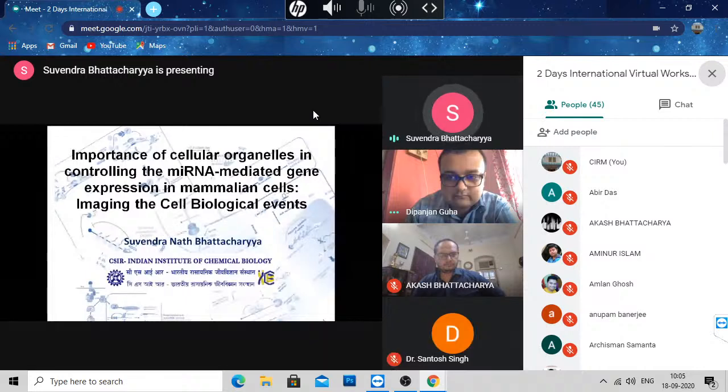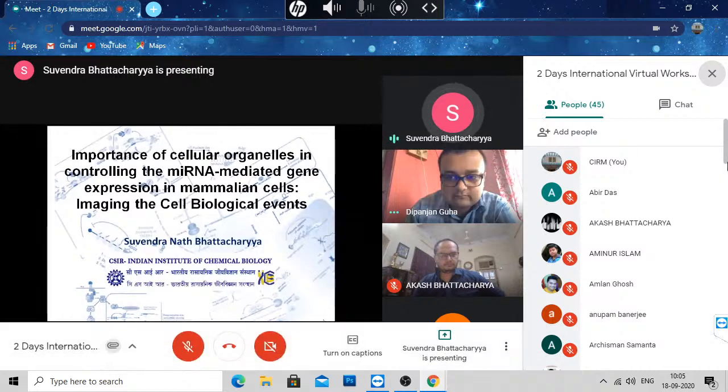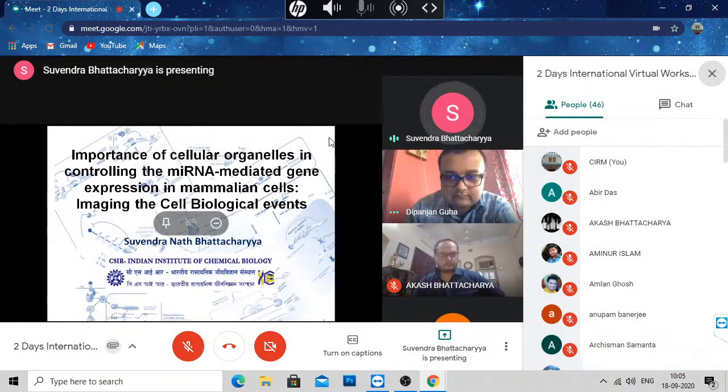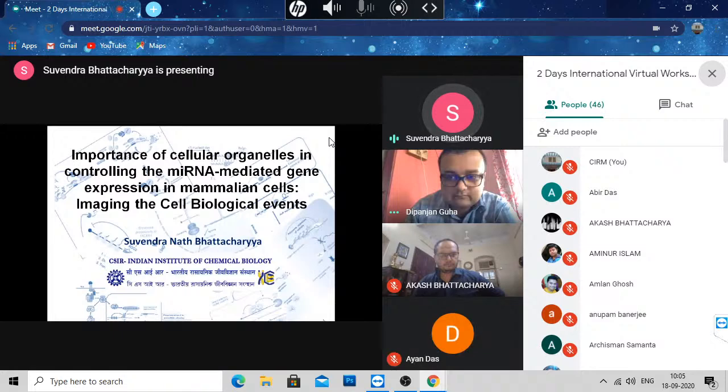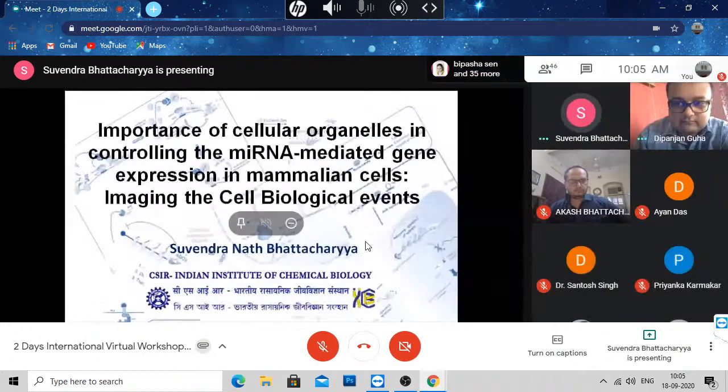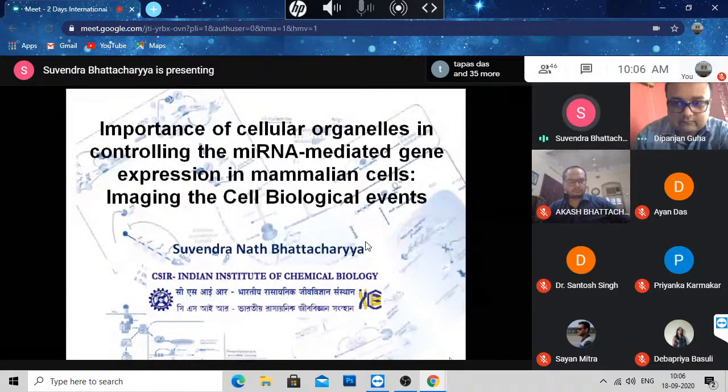I will gradually tell you how techniques like confocal microscopy or high-speed imaging have become useful in identifying some of the finer details of these events. So today's talk is on the importance of cellular organelles in controlling microRNA-mediated gene expression in mammalian cells and imaging the cell biological events.